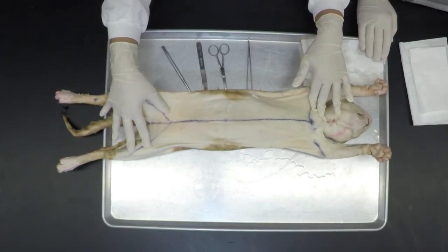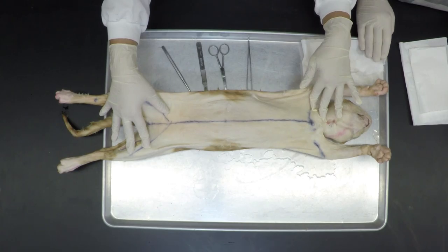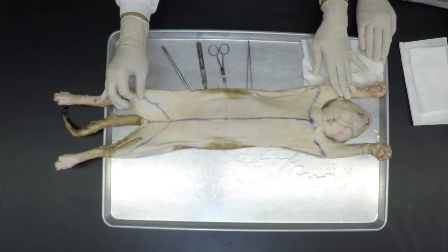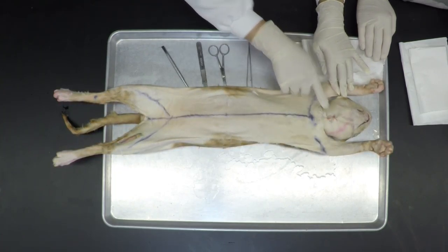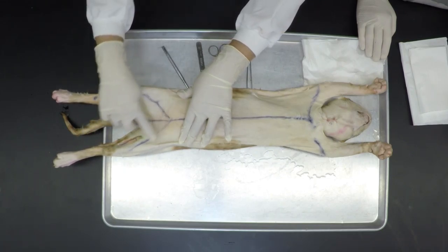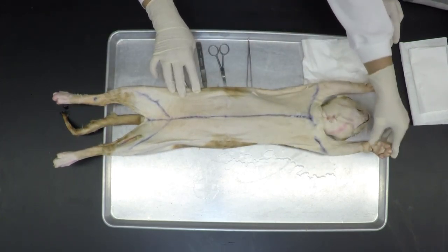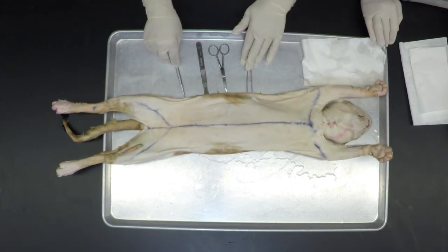Skinning the cat takes a long time, and you have to be careful not to cut the muscles underneath the skin. For this reason, to have a guideline, we line up the cat. How? We have one transverse cut in the axillary region, one passing through the midline of the body, reaching down to the inguinal region, and we cut along the foreleg to the wrist.